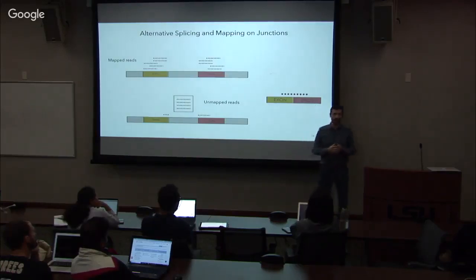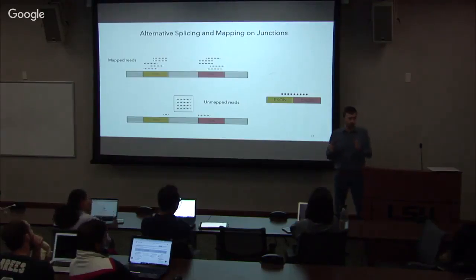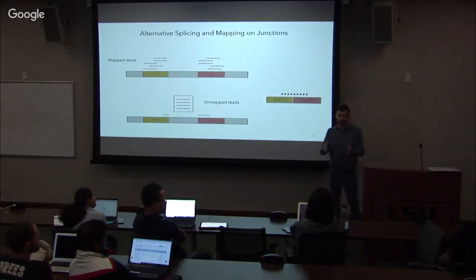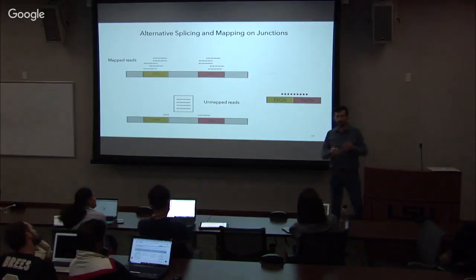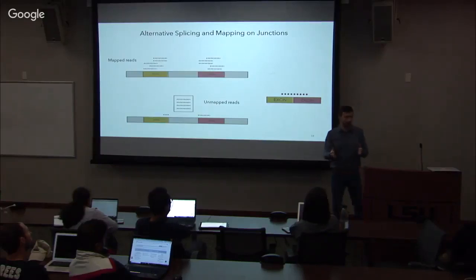So if you have several thousands of nucleotides, and then you have a 200 long read, you want to map that read in some region that it matches with some quality. So you give a threshold of quality, and then you eventually map it in different regions. And the reads stack up in a certain region, and that's what we call the expression of that region. It could be an exon or some kind of region where we can know the beginning, the end, and the height. So that would be the level of expression.